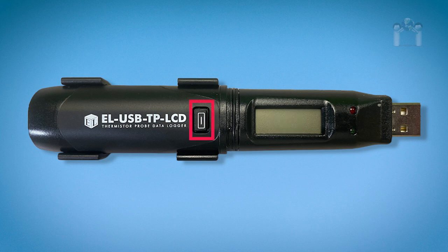If you push the button and see dashes, this is to let you know the data logger has not been set up for logging.